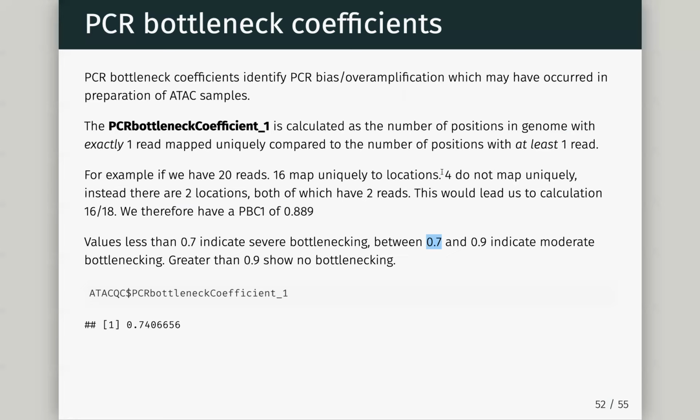As we can see here, we extract it the same way that we extract all the others, with the dollar sign and the element we're retrieving. And we can see we beat our score there as well. So this is a way of looking at the complexity of your data, library complexity. That's the end of this session.